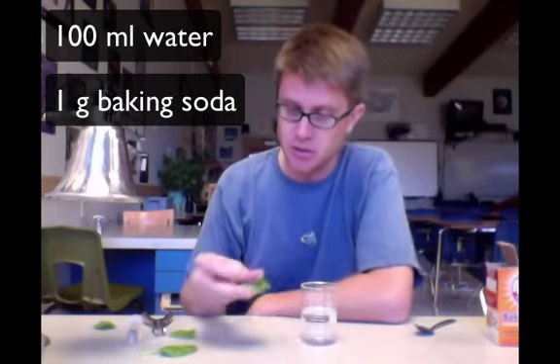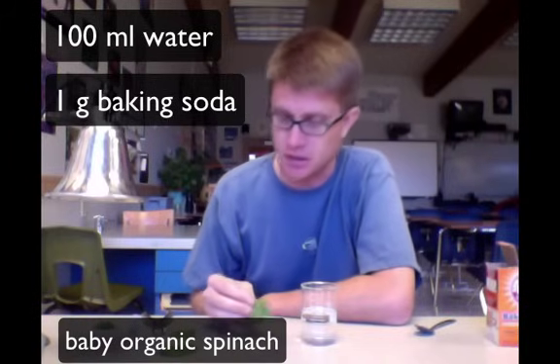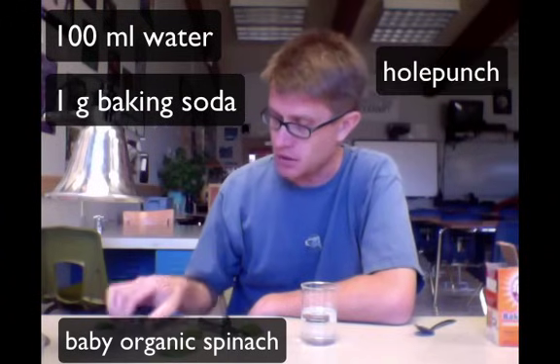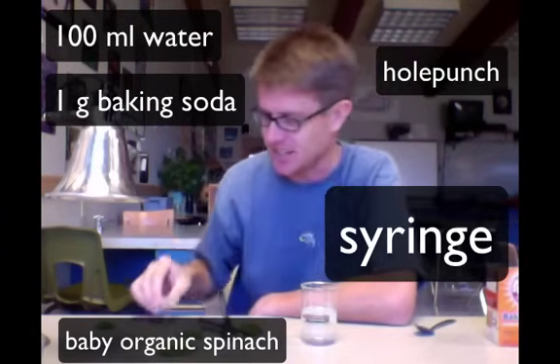Next we need a leaf, and so I use these baby spinach. It's organic spinach that I just buy at a nearby grocery store. You'll also need a hole punch and then you'll need a syringe. Take the needle out or it's not going to work real well.